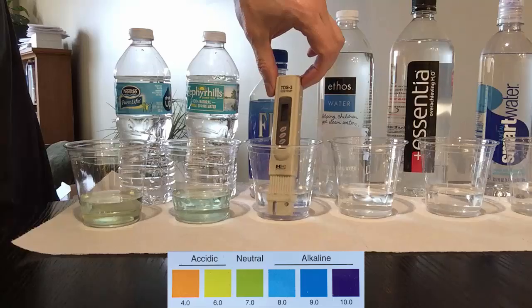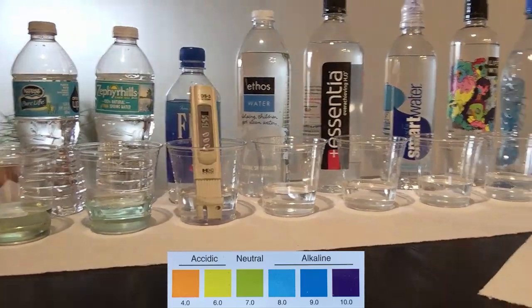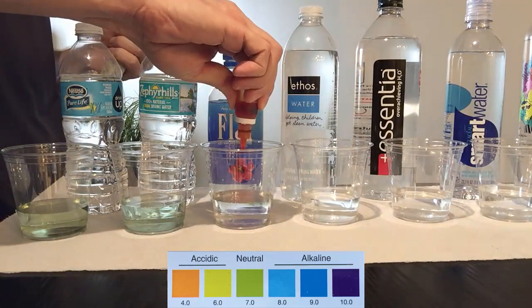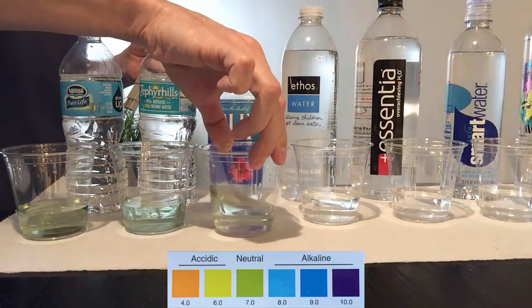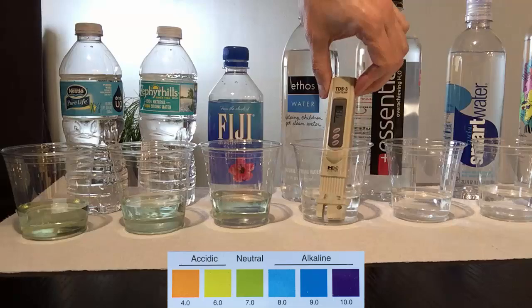The next bottle comes all the way from the beautiful island of Fiji, with a TDS of 155. This water has probably traveled for a few weeks through tropical heat, sitting in a plastic bottle and leaching chemicals into the water before it got to store shelves. The pH of this water is slightly alkaline.